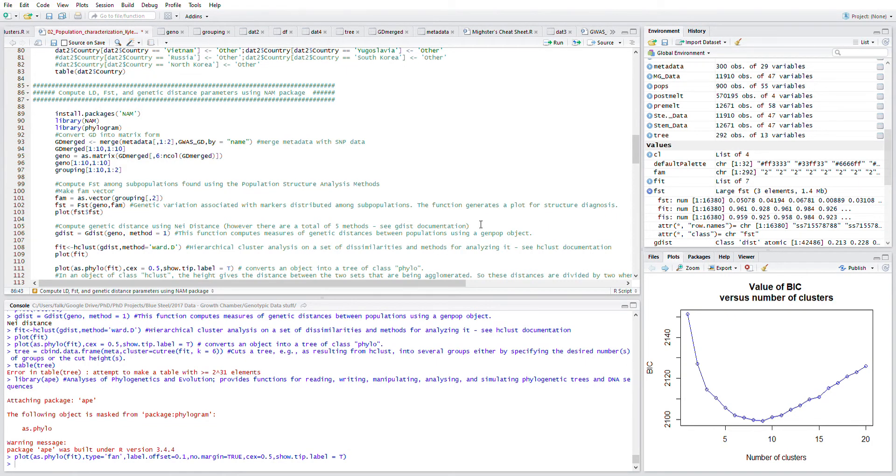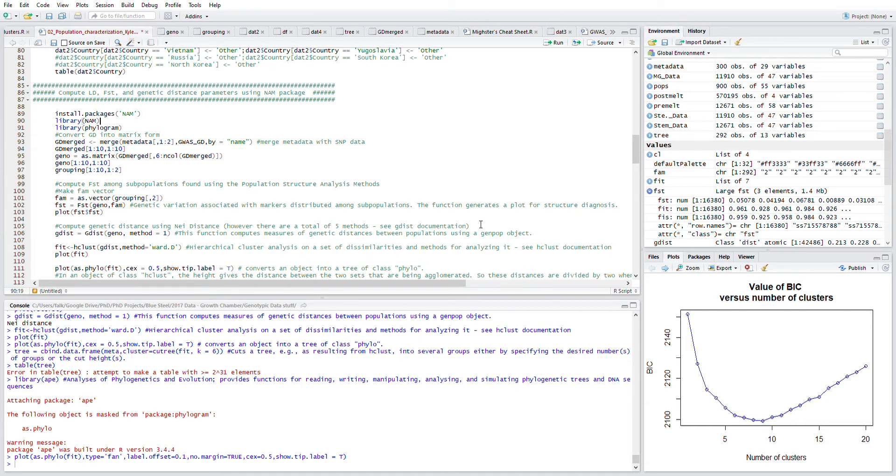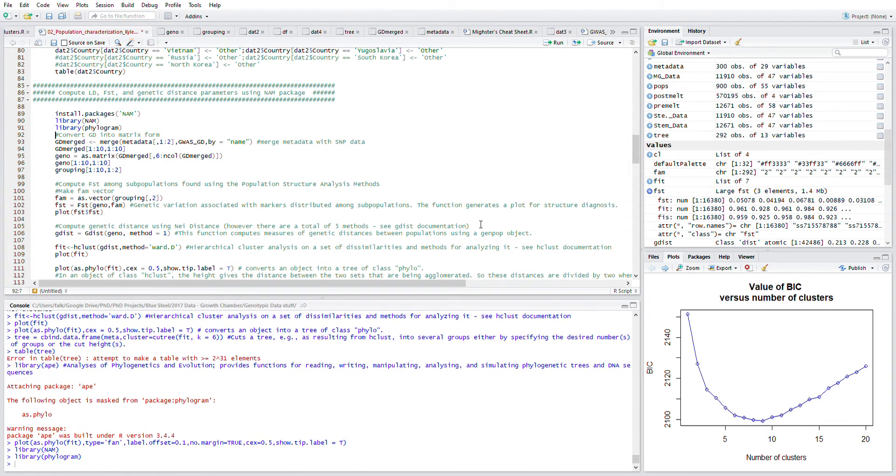Now that we have created the clusters using k-means, we can go ahead and compute using genetic distance a phylogram or dendrogram. First, I'm going to install these packages or the libraries for NAM and phylogram.